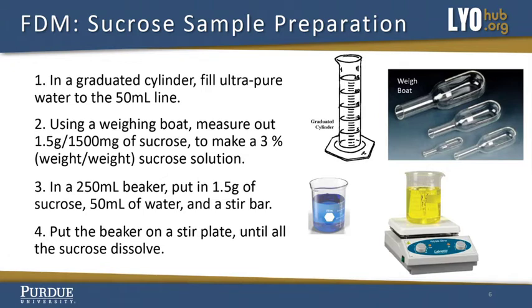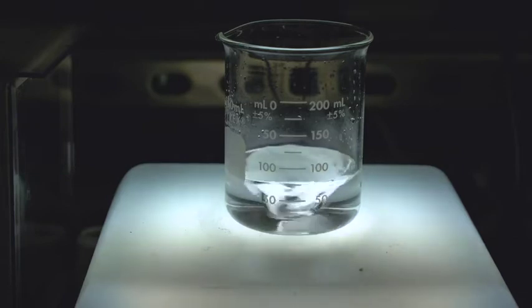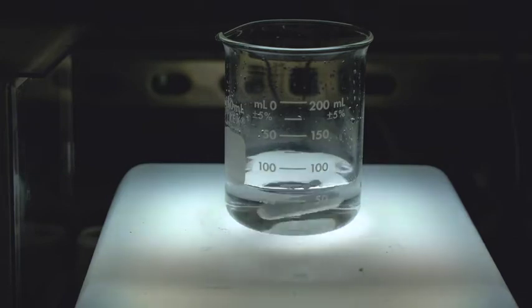In a 250 milliliter beaker, put in 1.5 grams of sucrose, 50 milliliters of water, and a stir bar. Put the beaker on a stir plate until all the sucrose dissolves.